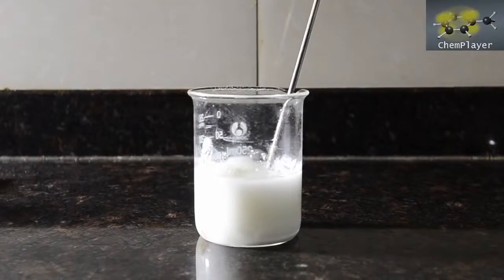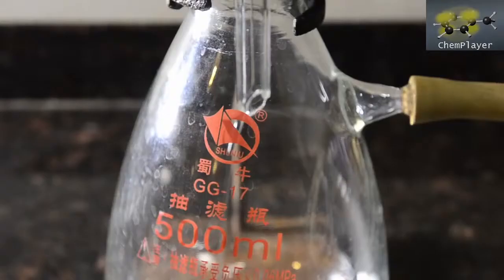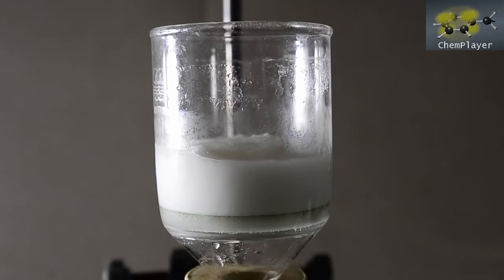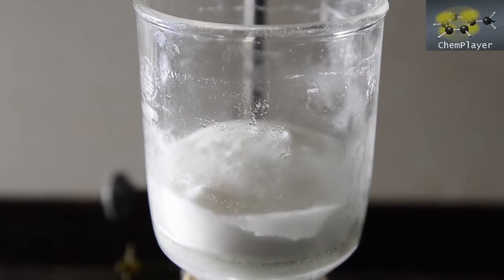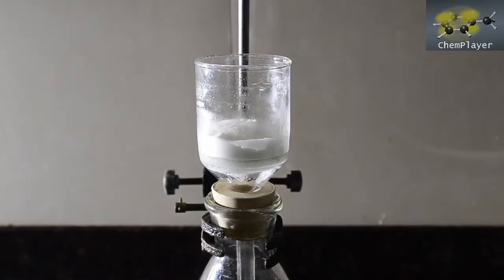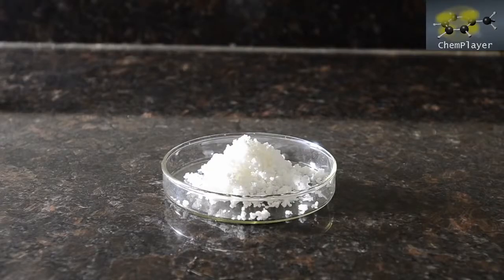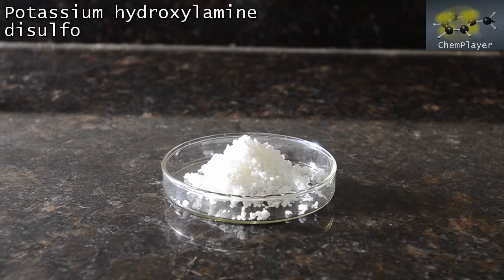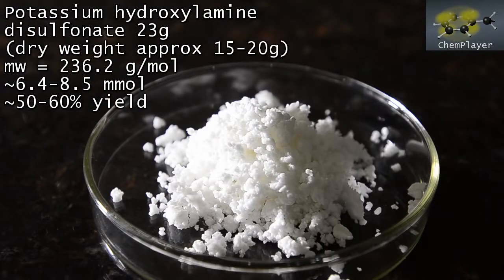So let's filter. The solid takes a lot of drying on the pump. Here we go. Not totally dry but nearly there. This is 23 grams of white solid. We're guessing a totally dry weight of somewhere between 15 and 20 grams. So a 50 to 60% yield of potassium hydroxylamine disulfonate.